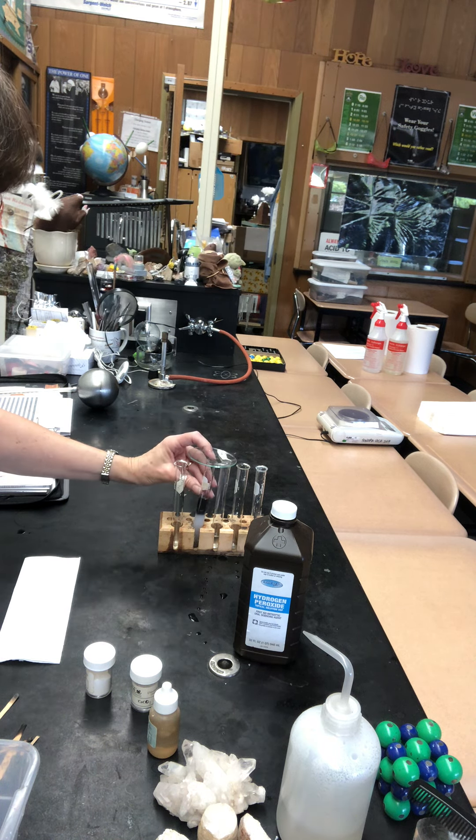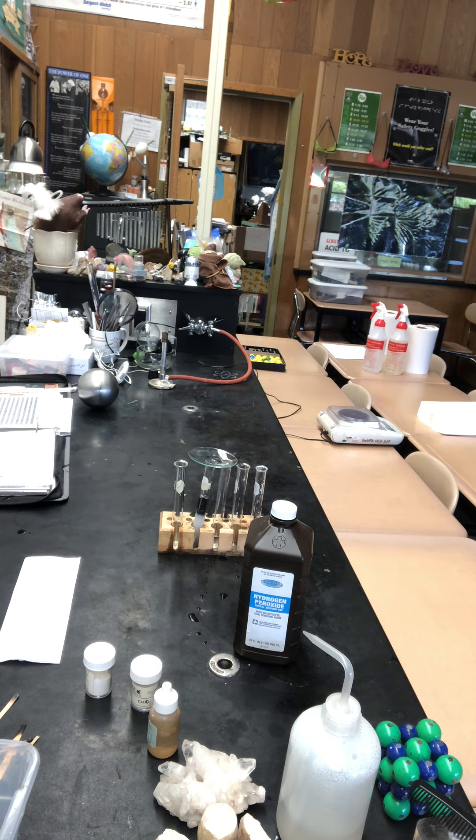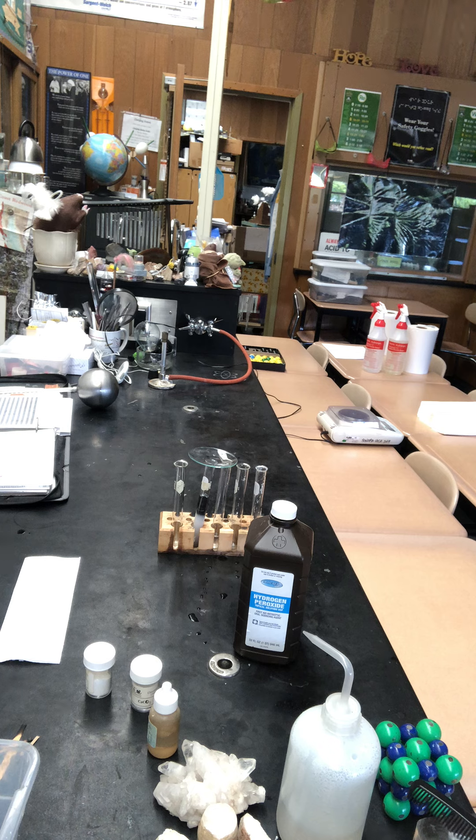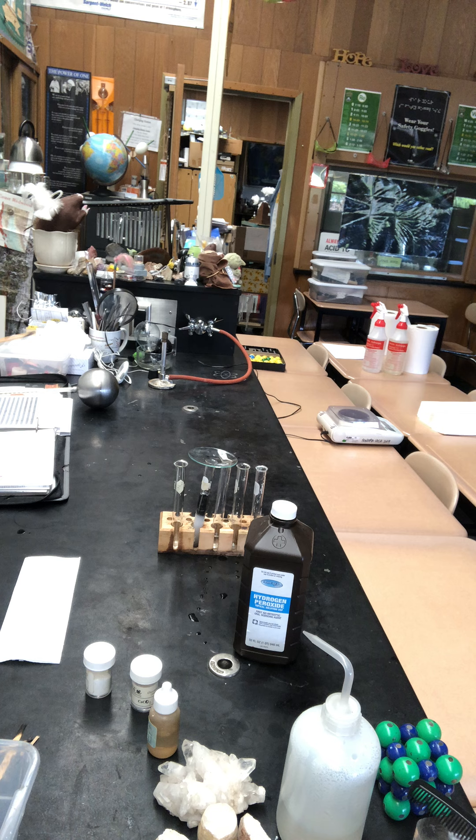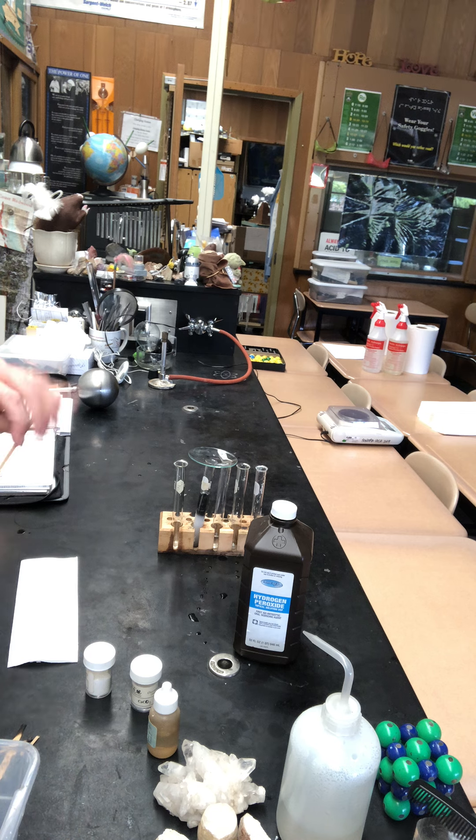So that is reacting, and this time since we predict oxygen is going to form, we're going to use a glowing splint. What do I mean by a glowing splint? I light it and then make it so it isn't on fire.